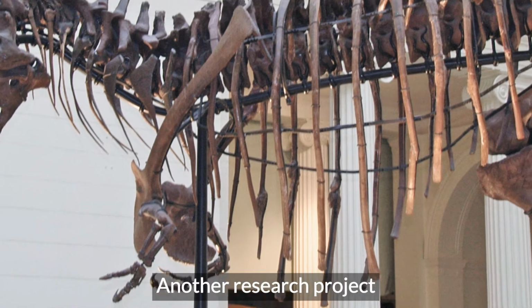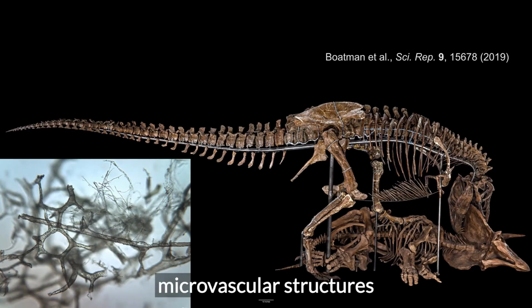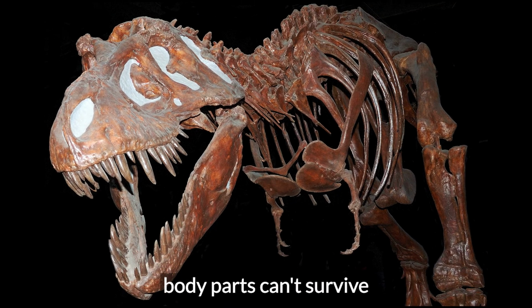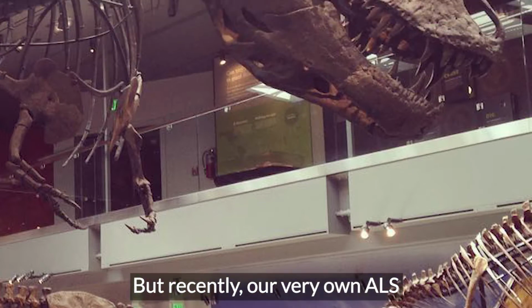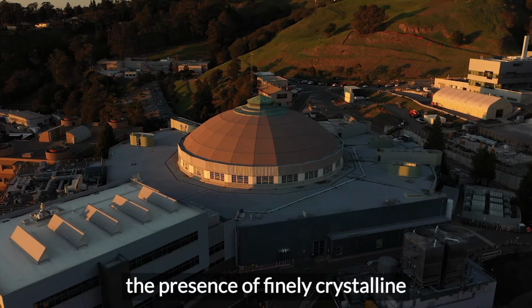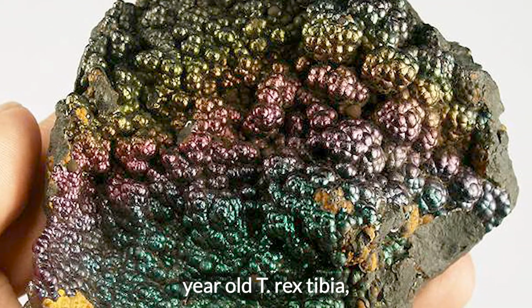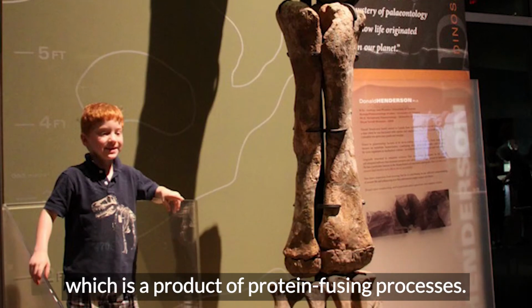Another research project that's made use of XANES spectroscopy is the survival of T-Rex microvascular structures from deep time. For a long time, the standard has been that protein-based body parts can't survive more than 1 million years, but recently our very own ALS has helped to prove that's not true. XANES spectroscopy aided in discovering the presence of finely crystalline goethite within a 66 million year old T-Rex tibia, which is a product of protein fusing processes.